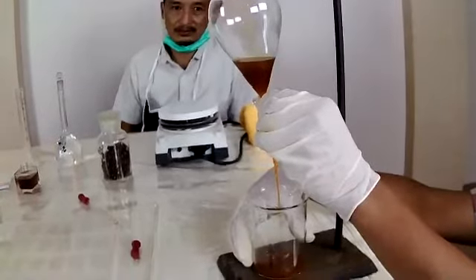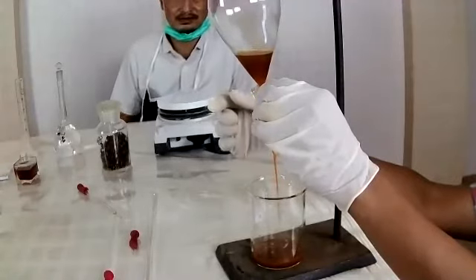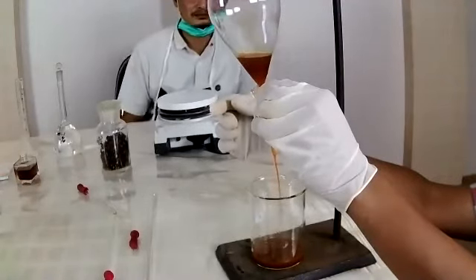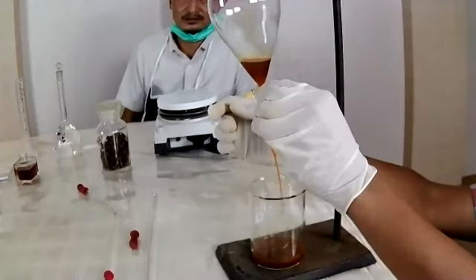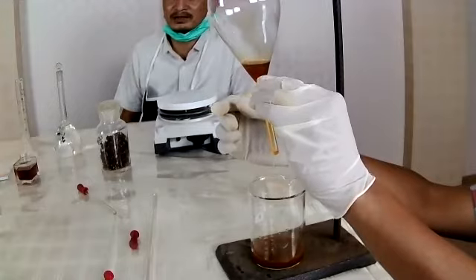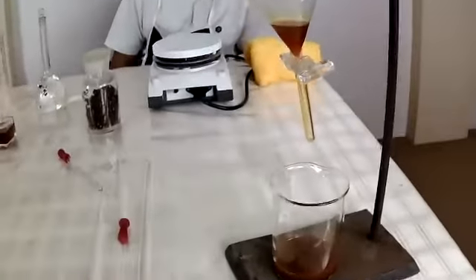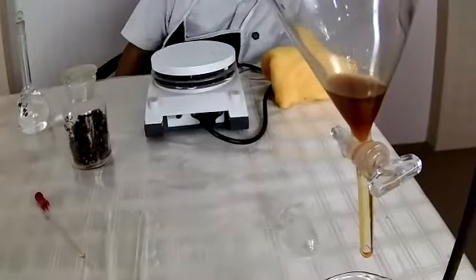You can take the sodium eugenolate, or the eugenol, here. The caryophyllene is separated from the property we want to have. Okay, stop. Maybe you can zoom in on this.